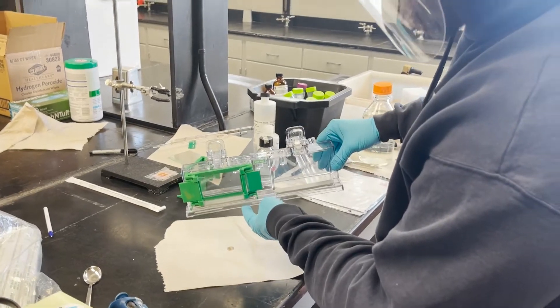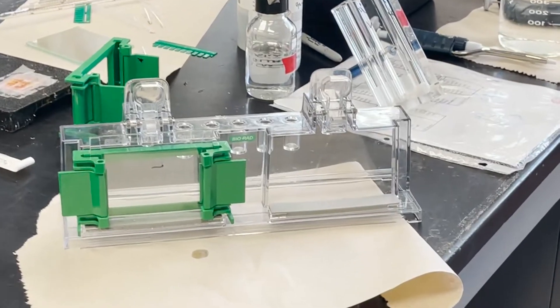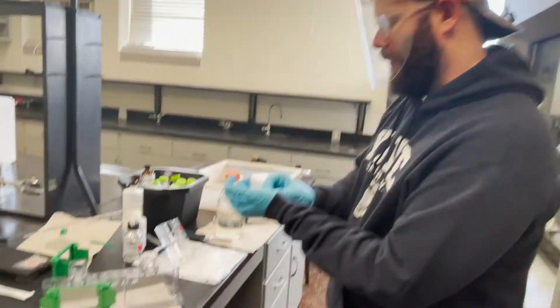I put a little plug in there and I'm going to let the plug polymerize. Give it five minutes, let the plug polymerize, and then we'll do the gradient pour.